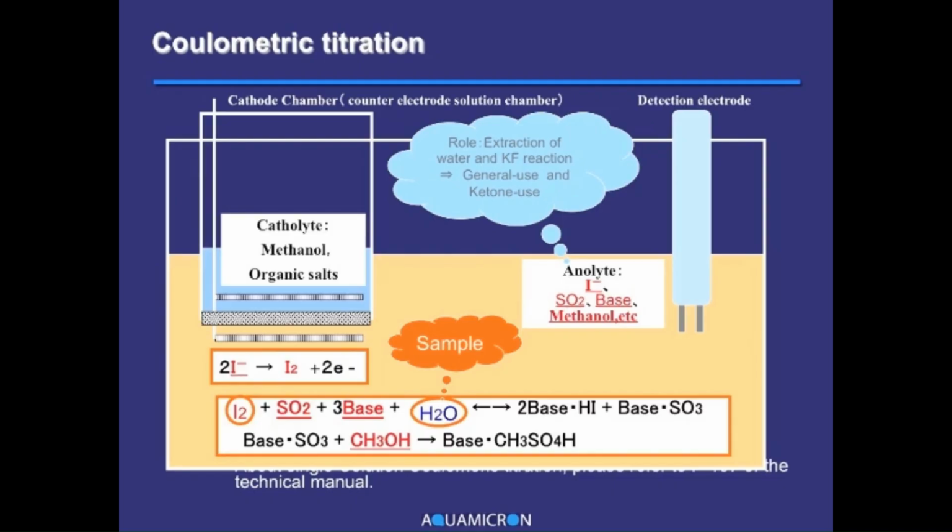Single-solution coulometric titration, in which only 1 solution, 1 reagent, or 1 electrolyte is needed, has already been developed. However, I would like to point out that a specified cathode chamber is necessary for single-solution coulometric titration. Please refer to page 197 of the technical manual for information about the optional single-solution coulometric titration.